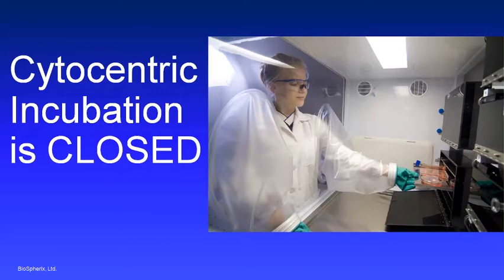The air is constantly warm to 37 degrees. And you can set it for physiologically relevant conditions because there's only tanked gases in this space. So oxygen, CO2, nitrogen, you can dial in the proper atmosphere for cells for this cell handling space. And it's closed off from room air, so it's closed off from all that variability that comes with doors opening into a room air space.